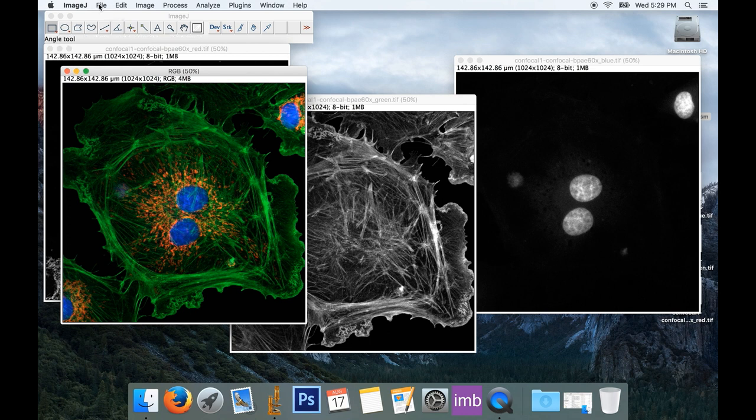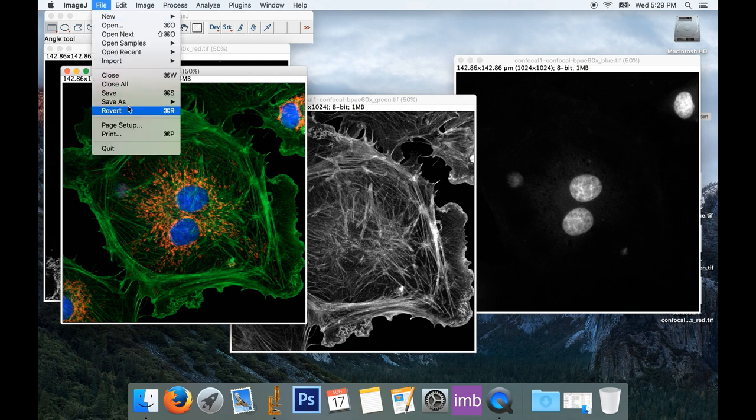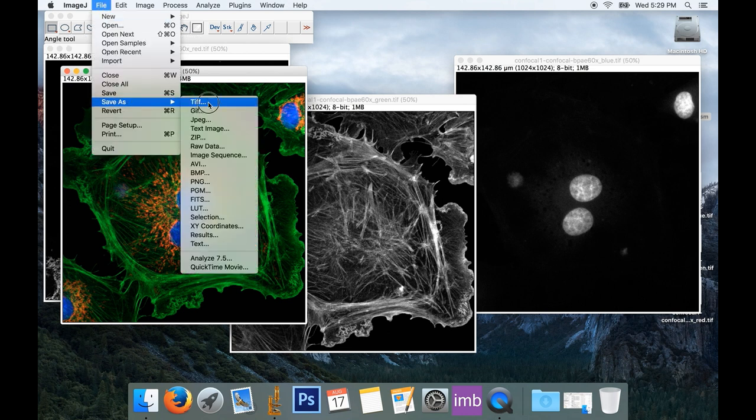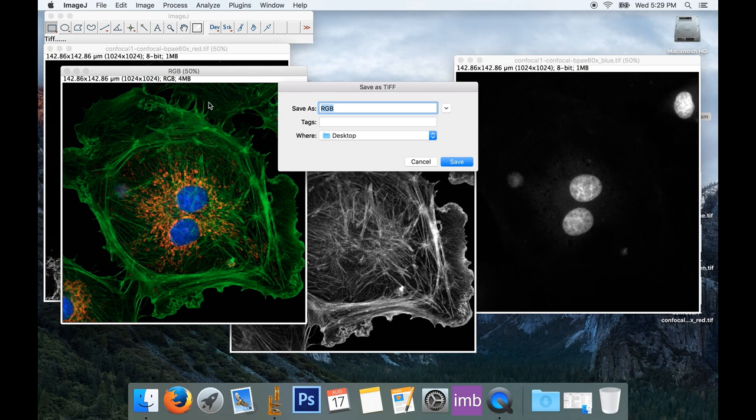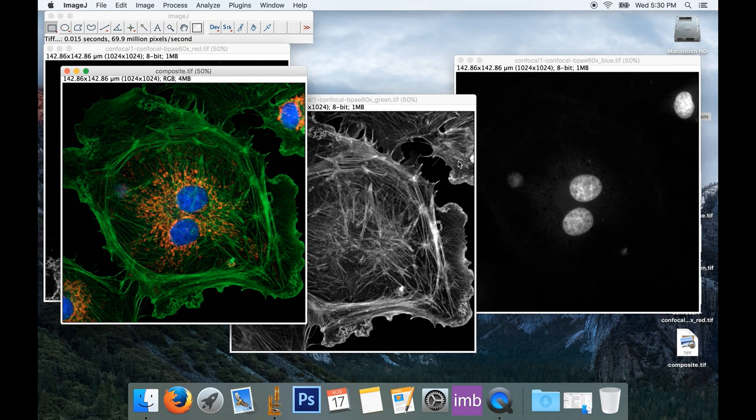Now I can choose to save this file, save as TIFF, and we always save as a TIFF, and I'll just call this one Composite, and we'll save it back to the desktop, and we're done.